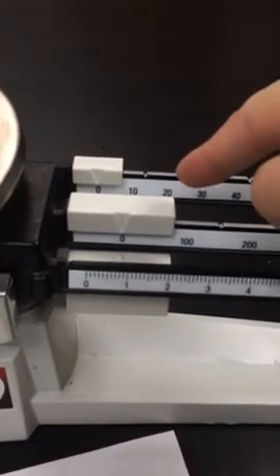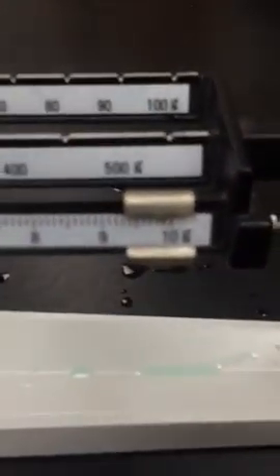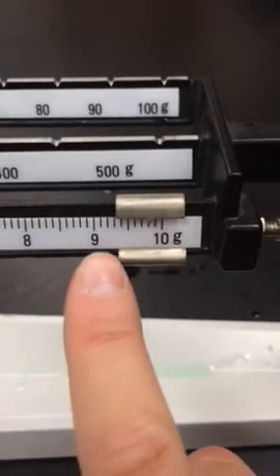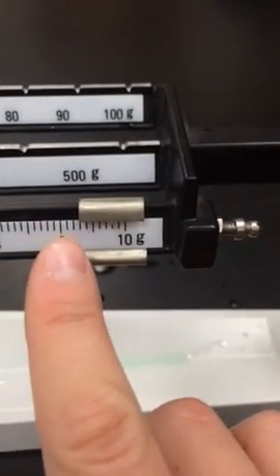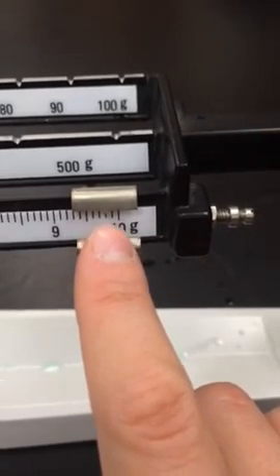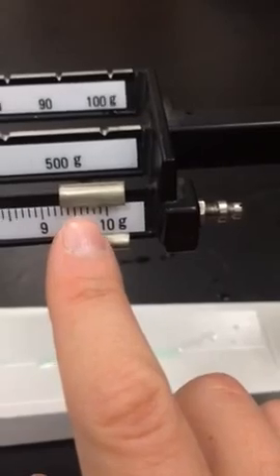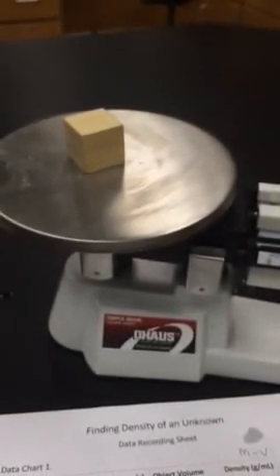Okay, so now if we look at our weights, you're going to have to write down your answer this time. You've got 0 in the hundreds, 0 in the tens. Then we look at our ones. We are at, let me see if I can make this clearer for you. There we go. 9. And this would be, oops, sorry, it was back here. This would be 9.5. So we're a couple lines past that. So this would be 9.1, 2, 3, 4, 5, 6, 7, 8. Okay, this weighs 9.8 grams.